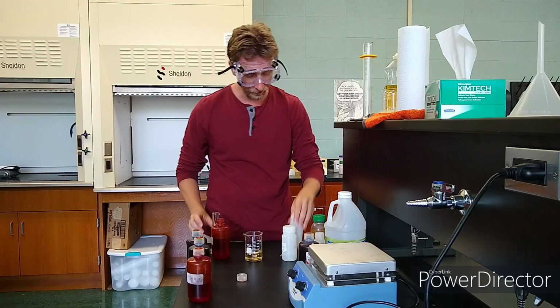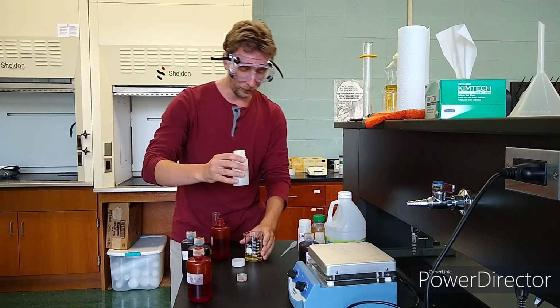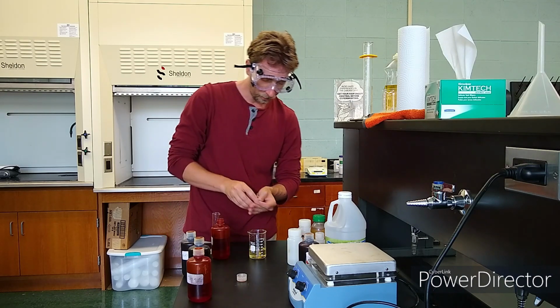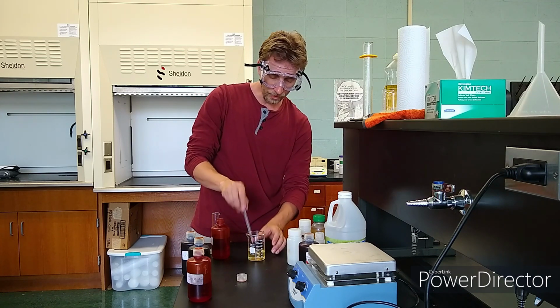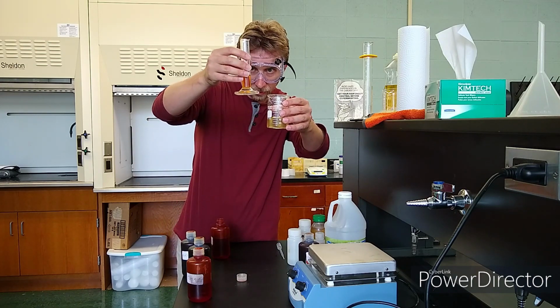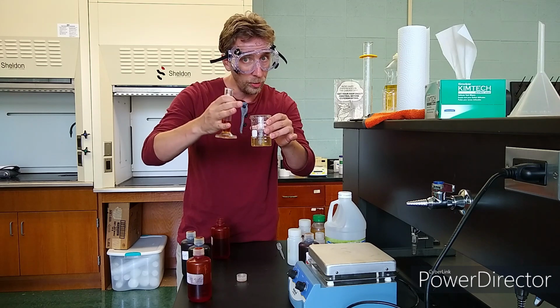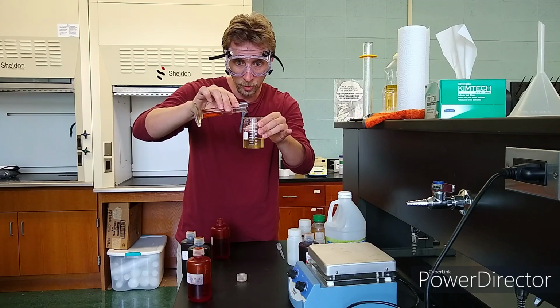Oops, you know what I forgot? Starch. Got to have the starch in there. So a little dollop of starch. There we go. Stir that up. That's my juice mixture for the quick check. This is under 10 milliliters of iodine. Now, what do you think it's going to do? Remember when it was just water and starch and I put in the iodine? It turned a nice purple color. Well, let's see what happens here.